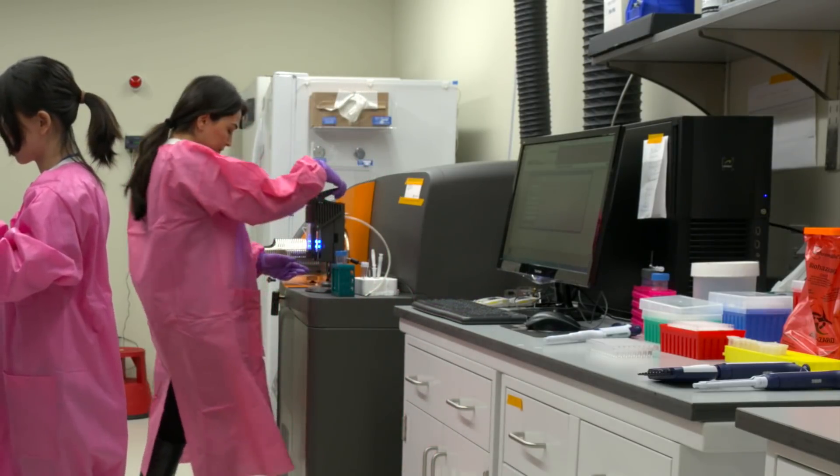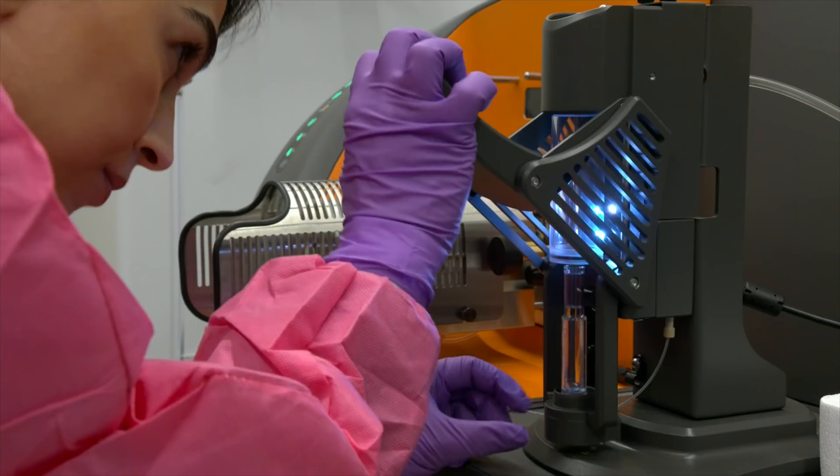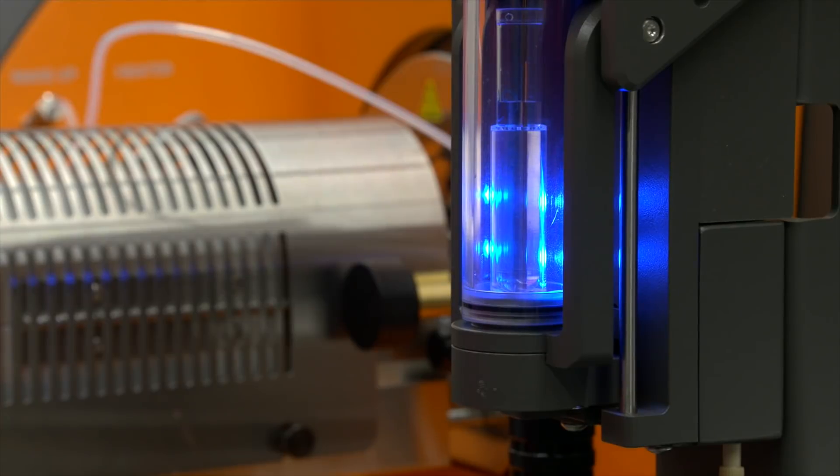NCATS is working to solve this translational science problem through strategic collaborations with public and private sector investigators across various research disciplines. Through the Stem Cell Translation Laboratory, NCATS is improving health through smarter science.